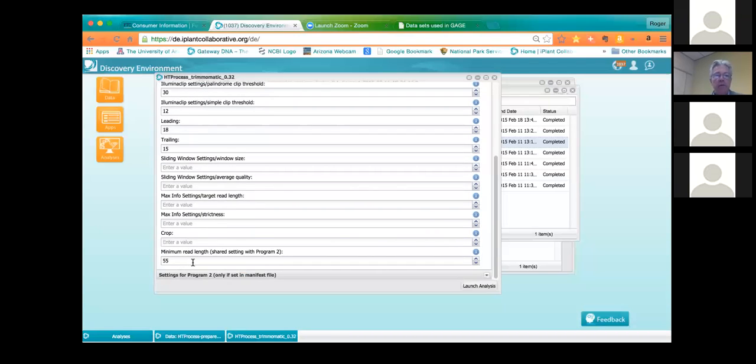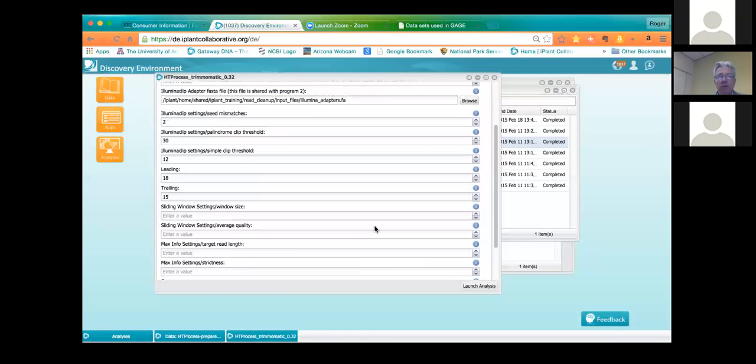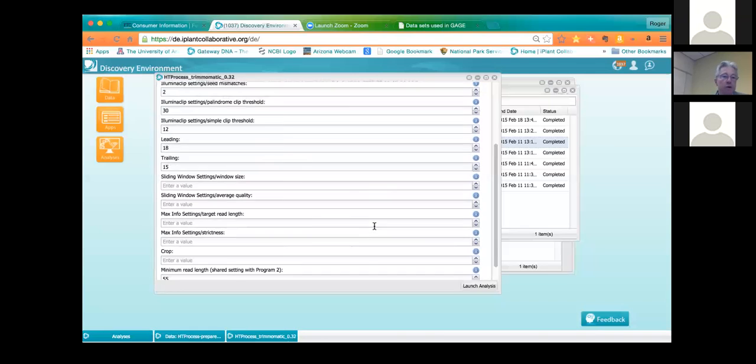And then here, if you're doing quality trimming, it's often good to enter a value for what you want to leave as a minimum read length. The thinking behind this to some extent is, well, if I'm going to have to cut off, say, 40% of a read, maybe the rest of it is sort of doubtful too. Maybe it just wasn't a good read at all. But you have to use some judgment and decide again how much you need that read, and how likely it is that it's going to be all bad, or also how useful it may be for your downstream applications if it's too short. That's another consideration.